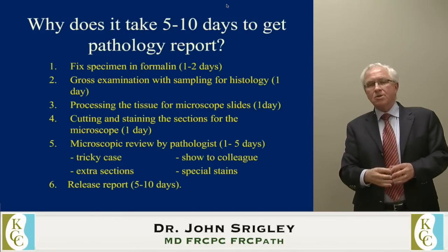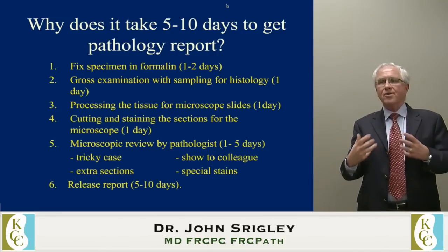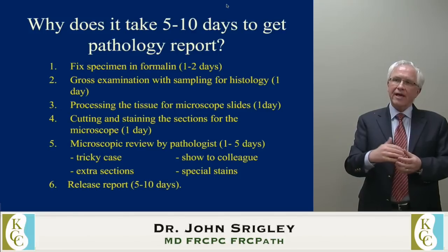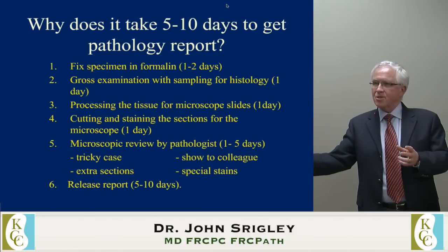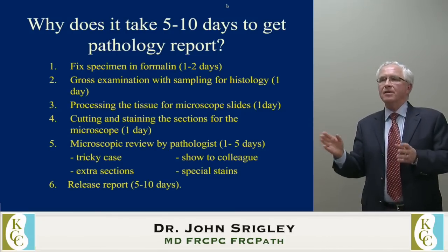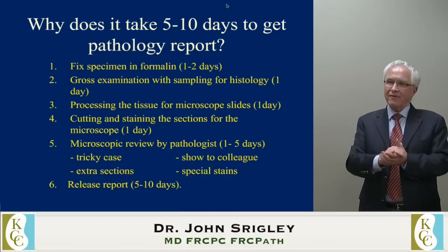So why does it take so long? When people have their surgery, a lot of them say, well, why isn't the pathology report out the next day, or why is it taking so long? Well, the process of looking at a specimen, having it processed, and then reviewing those slides under the microscope takes, for a specimen of this type, anywhere from 5 to 10 days in the system that we have here.